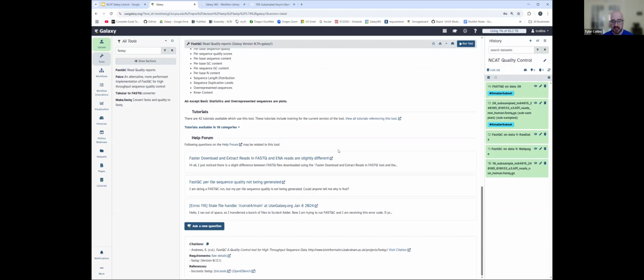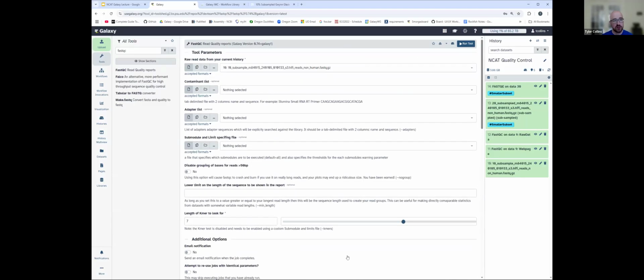There'll be a link to the Galaxy help forum, where people from Galaxy answer questions all the time. So there'll be other questions people have asked about this tool or problems they've had with it, which is a good resource if you need help. You also have a link to go ask a question immediately if you would like. And then finally, you'll have the actual citations, and usually a link to the original GitHub repository or other spot where the tool is, if you want to find the tool and run it locally or see the actual source code behind it. So for our case, if you have the subsample data in, you can just hit run tool here and it will start running.